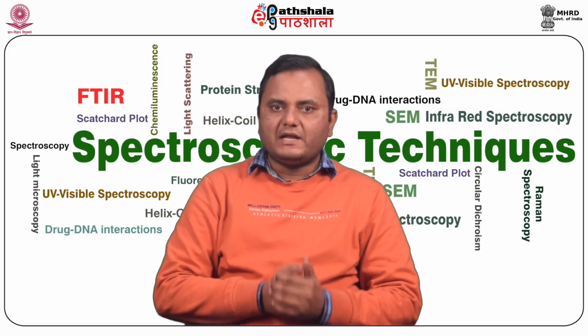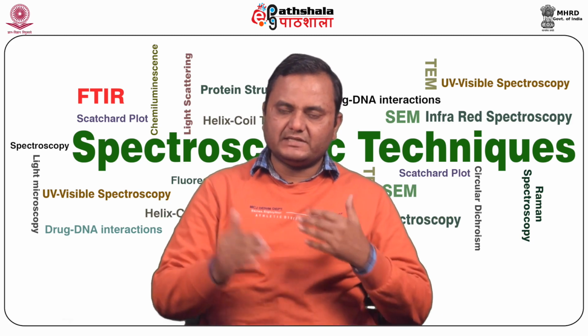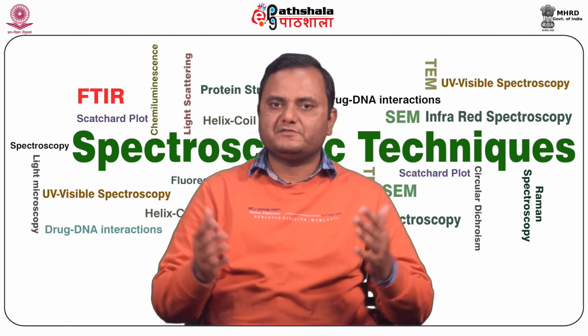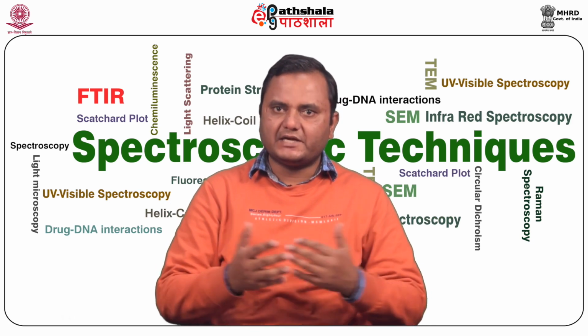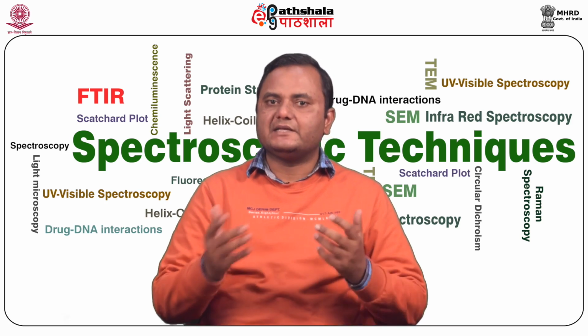There are several online tools available to analyze the spectra, and based on the spectra analysis they give you information about the content of secondary structure. By that you can deconvolute or decompose the spectra and get the structural information.